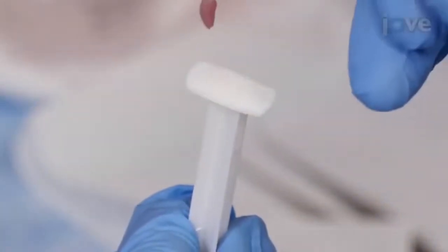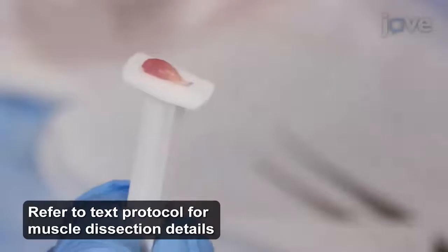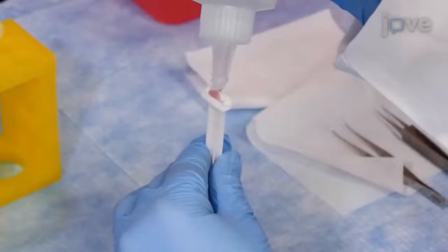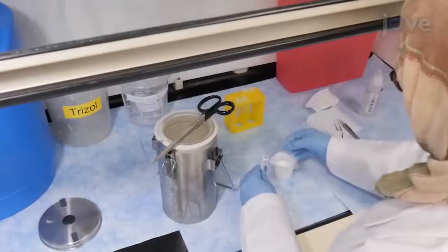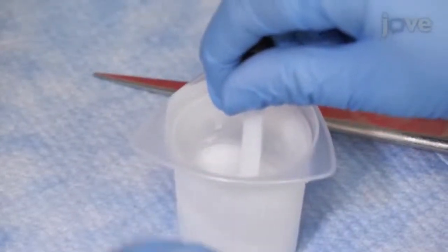Lay the dissected tibialis anterior muscle onto the flat surface of a small plastic syringe plunger. Next, cover the dissected muscle with a few drops of Optimal Cutting Temperature Compound, or OCT. Remove the beaker of methylbutane from the liquid nitrogen bath, then thaw the surface using the handles of a pair of scissors. Quickly dip the OCT-covered tissue into the melted methylbutane to snap freeze it.